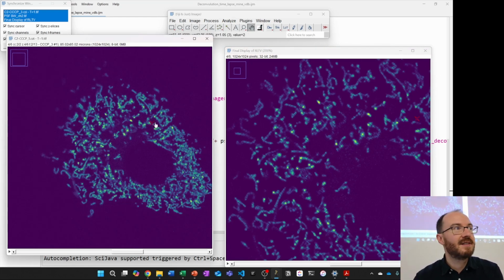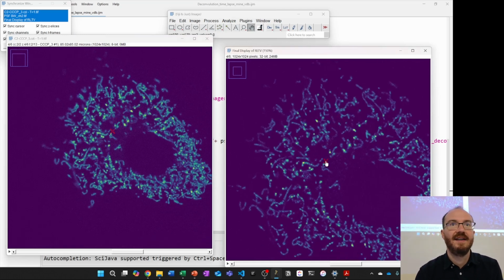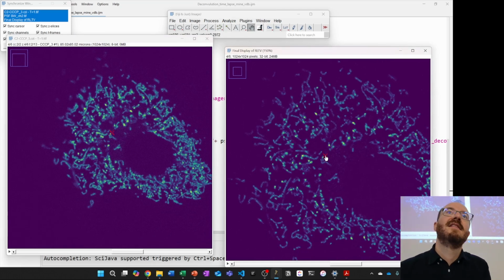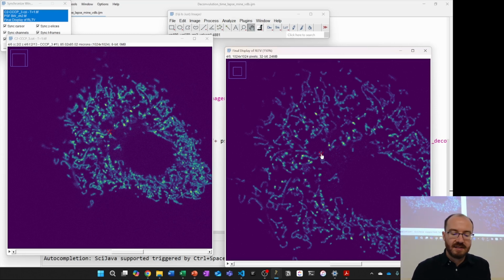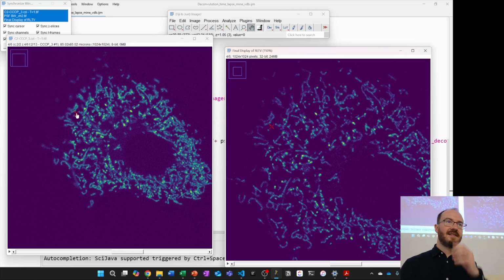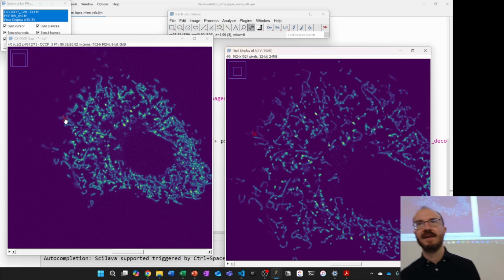Okay, any questions about deconvolution? Yeah. Is it really helpful if you don't have a clear image, or is it still? Yes, so the point is that this intensity image is not a true representation of what I have. So if I was to start to calculate the average size of something, it would say that in Z, the size extends all the way to this level, where in reality it didn't. So I would have wrong sizes or wrong volumes or areas associated to structures if I don't deconvolve them.